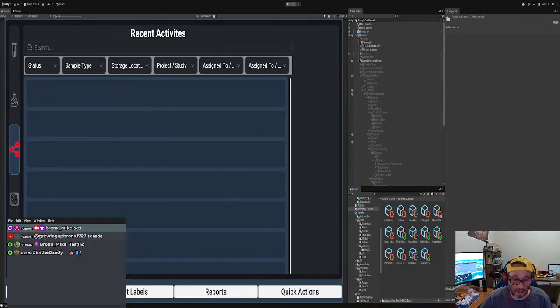And in Docker, what's my Docker? Let me look at my website. Data. Test results. No, we have no test results whatsoever, but we did have that sample data, test orders. We have test orders and we have tests.